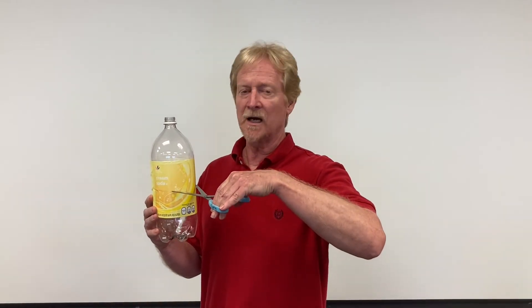You can make your own Berlese funnel out of a plastic two-liter bottle. To make your Berlese funnel, you take your two-liter soda bottle and you make a cut right along here. You also want to remove the label.